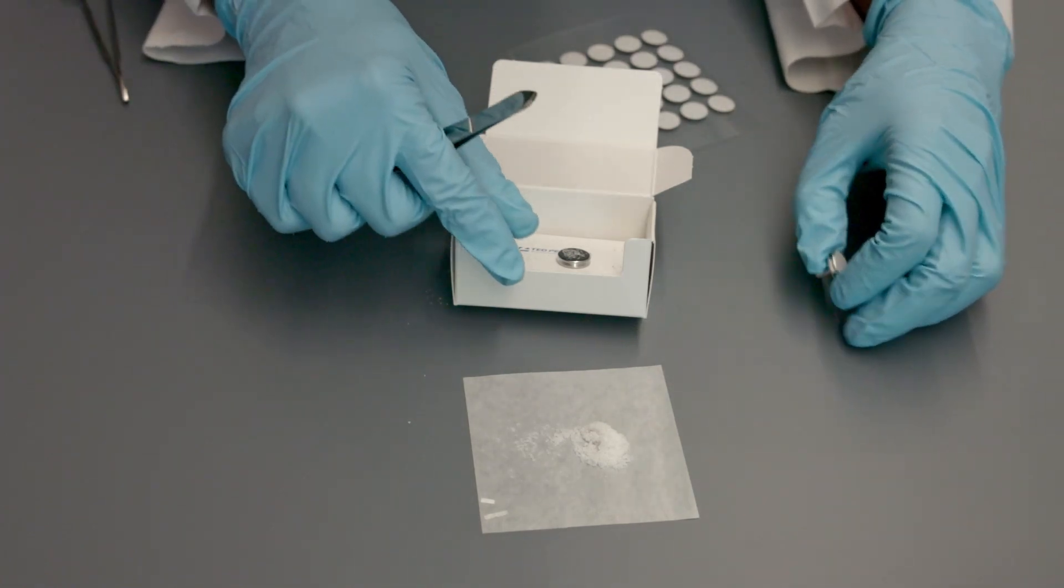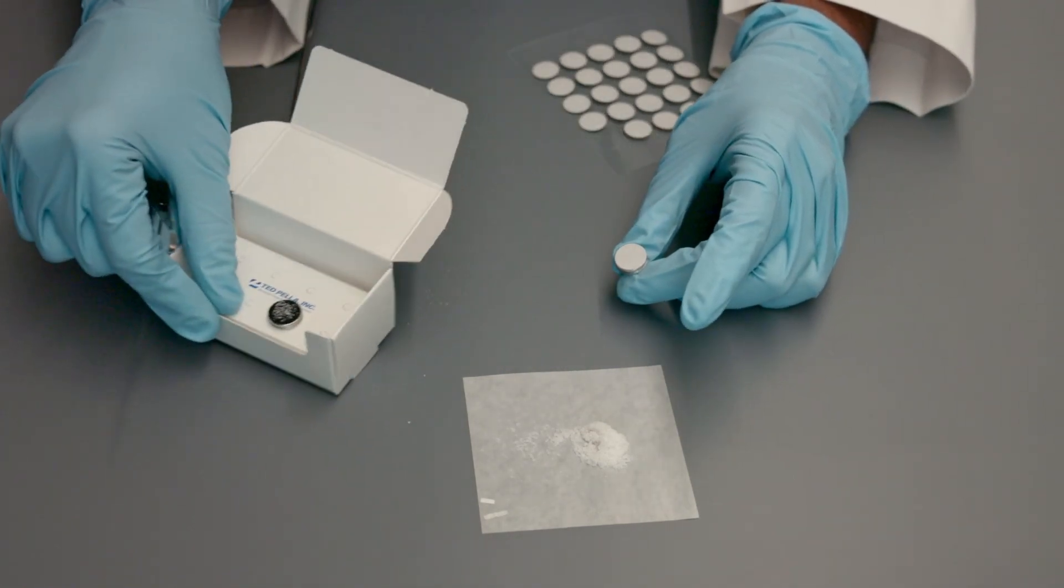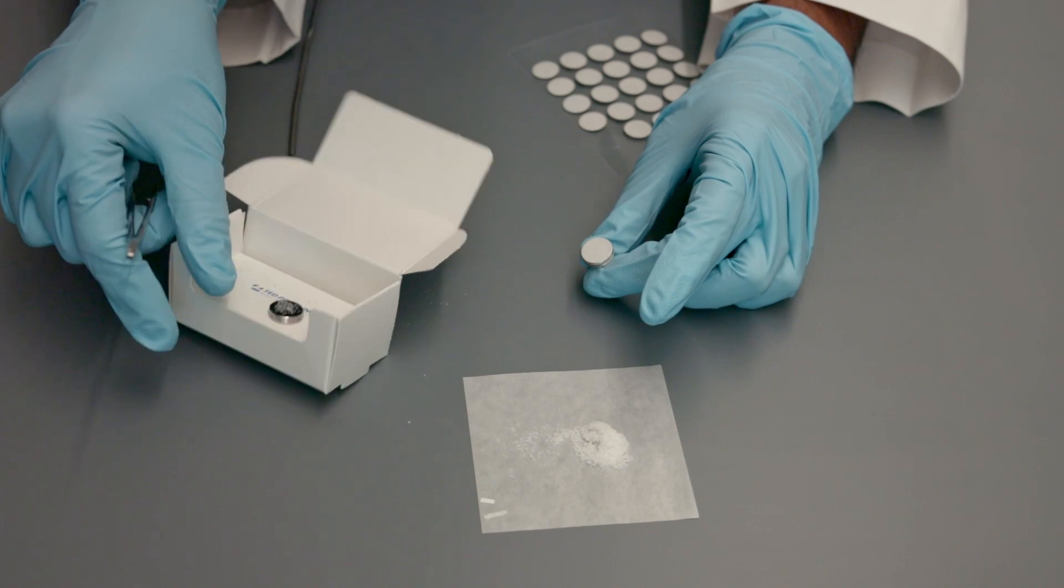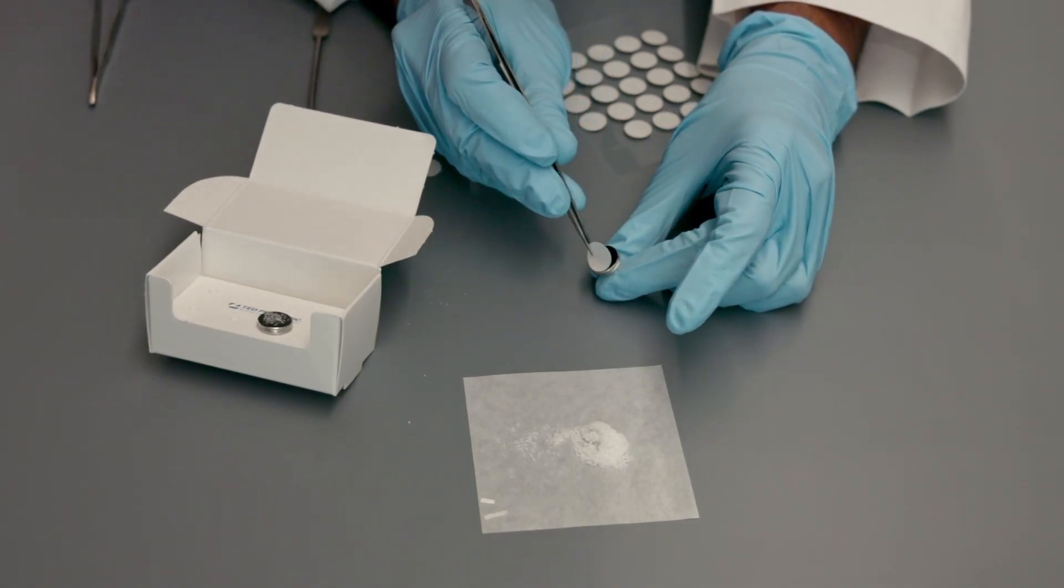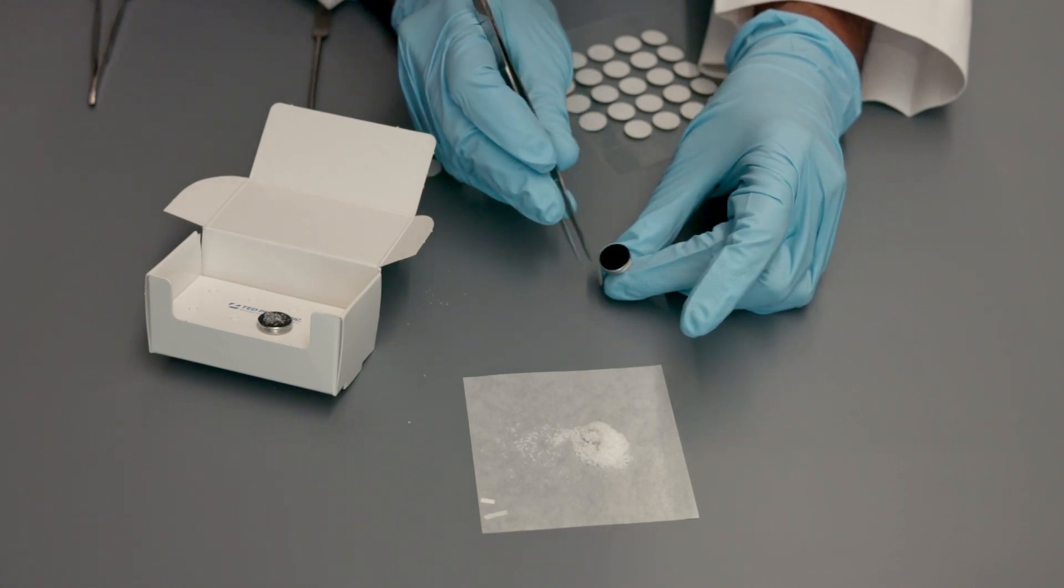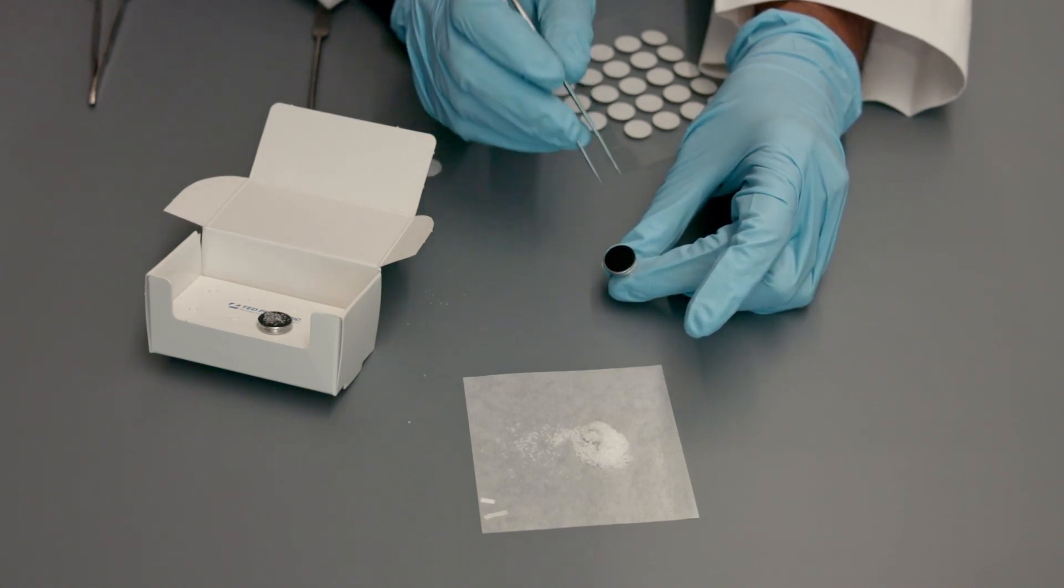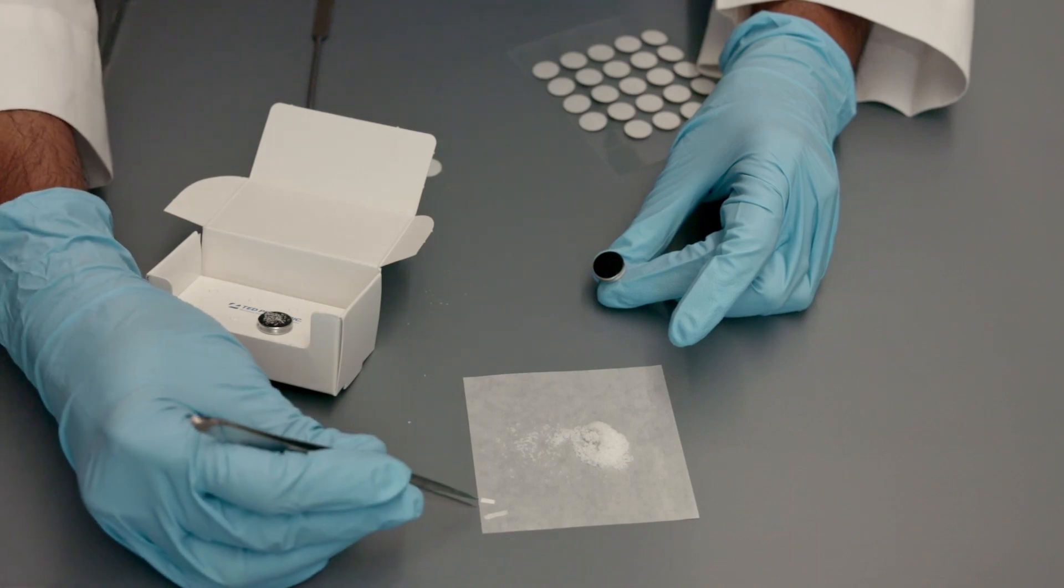Let's prepare another sample using the same process. Remove the top liner on the conductive carbon tape and place the samples on the mount.